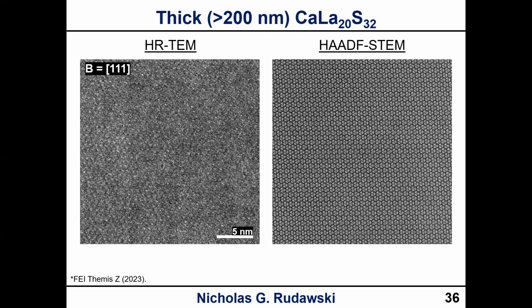So one thing I would suggest is, if you're not getting the full picture just from your imaging and diffraction patterns, do some kind of analytical analysis as well, whether that's EDS mapping or EELS mapping, to complement that, because that may be what you need in order to delineate those.